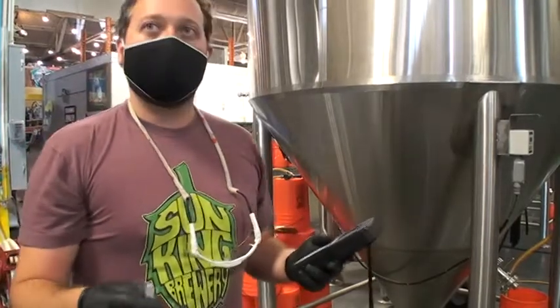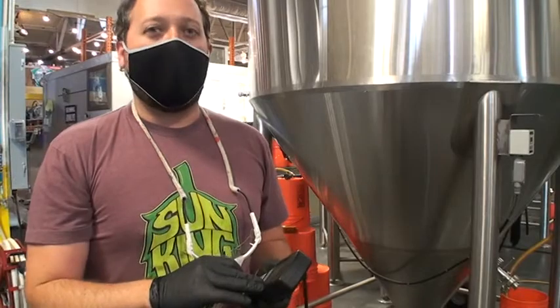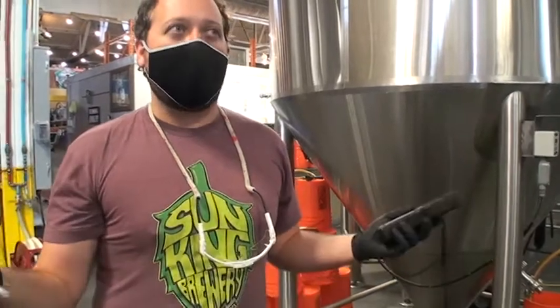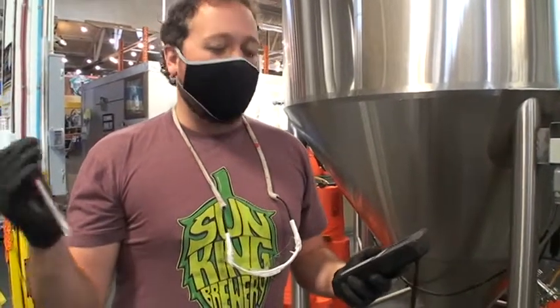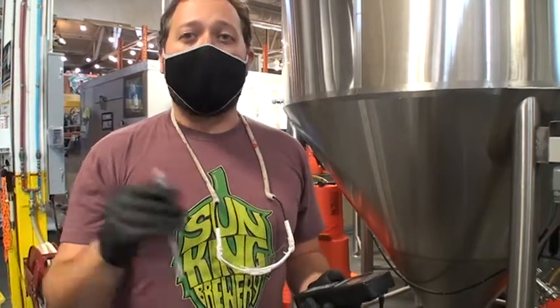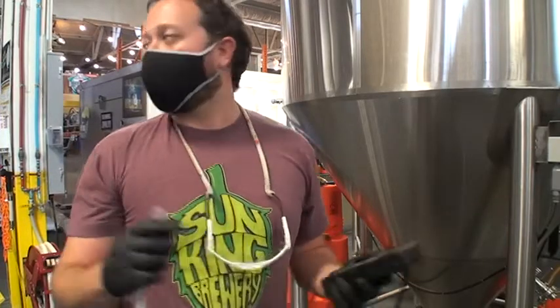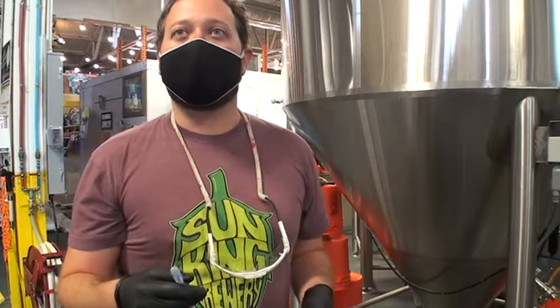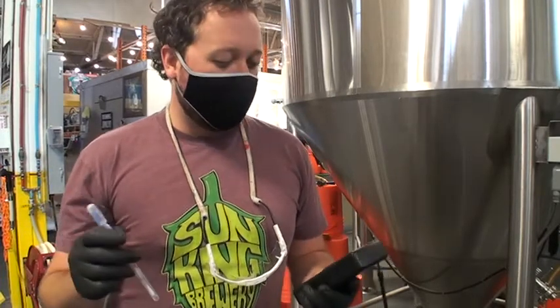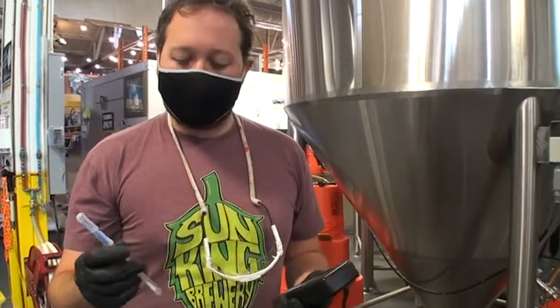And how expensive are these? So the meter itself is around $1,200. We've got ours through a supplier called Weber Scientific. They have a special where if you commit to buying two boxes of swabs, 100 swabs in a box, for a year, they give you the meter for free. Great deal. The swabs will last for 2 years, kept cold, so it's pretty much a no-brainer for us. It's a great way to check your cleanliness.